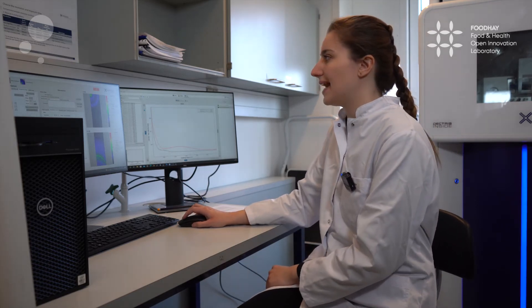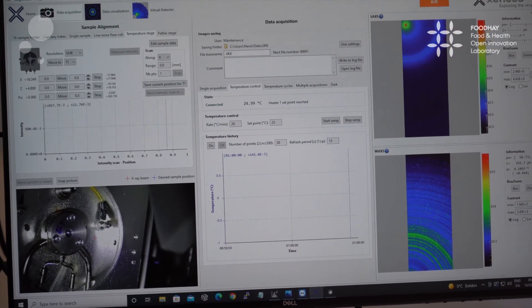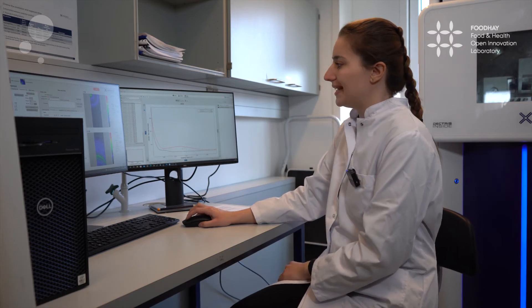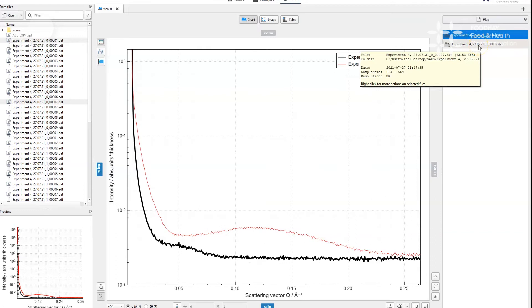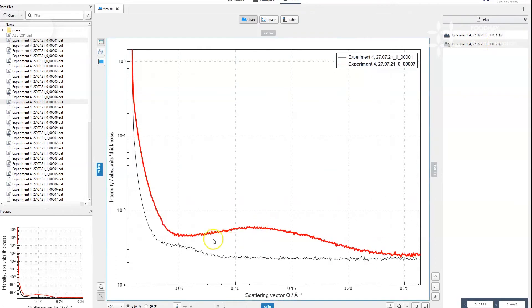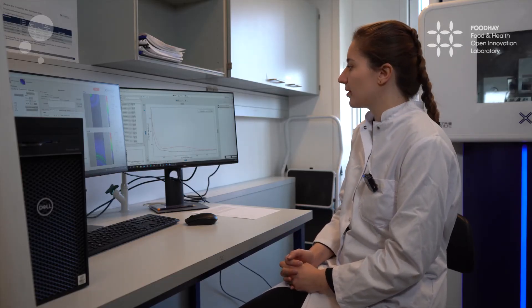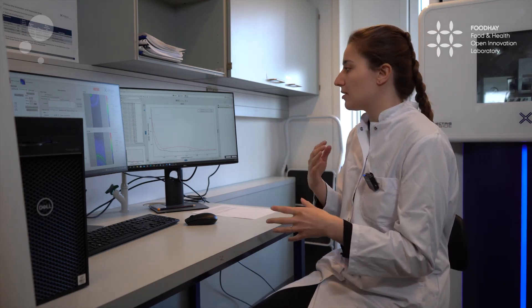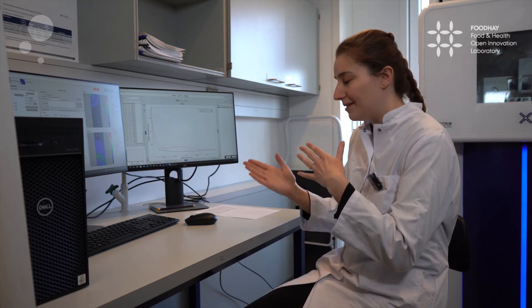Once the measurements are finished, we end with a 2D center-symmetric graph. This graph can very easily be translated to a 1D curve, such as here to the right. This curve shows the intensity of the X-rays versus the scattering vector, which is directly proportional to the angle of the scattered X-rays, just normalized by the wavelength. The red curve here shows a liposome signal — normal food-grade liposomes in water. What I was looking to study is more information about the bilayer of the liposomes, the packing of the individual lipids, and information about the lipid head groups and tail groups.